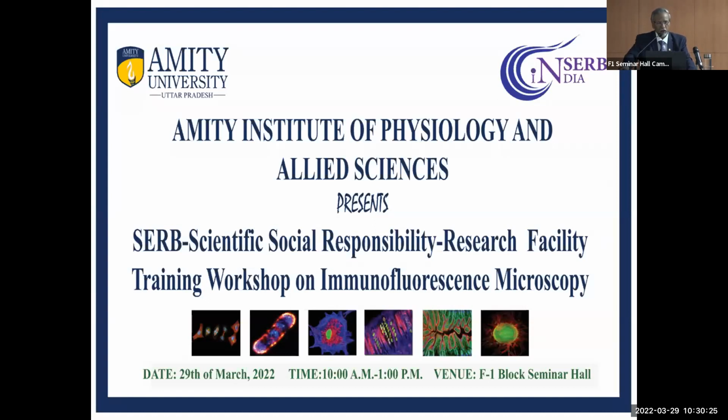So you have to be sure, not just the absence of a Barr body, but in the amniotic fluid slide it is important to see that the Y body, the Y chromatin, is also there. That is stained by quinacrine or any other fluorescence dye which is DNA bound, particularly those that bind repeat sequences or heterochromatin.